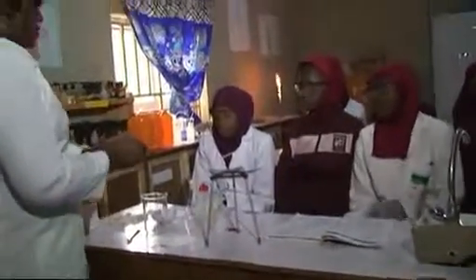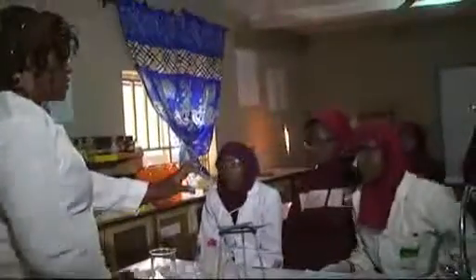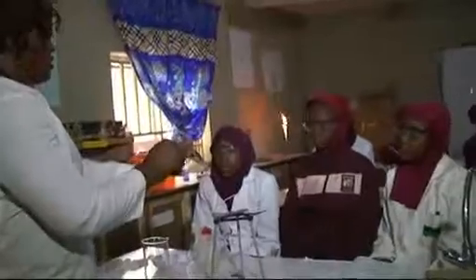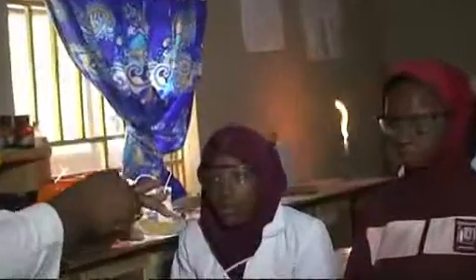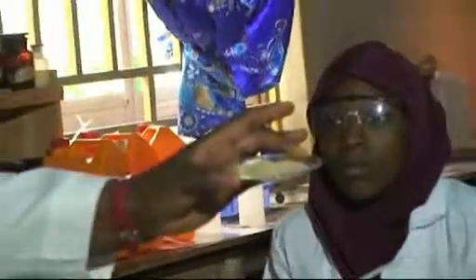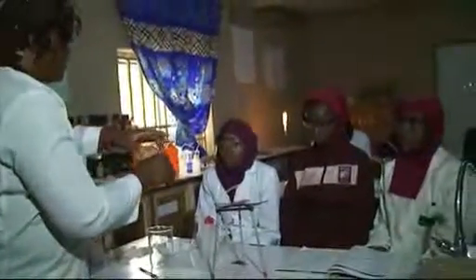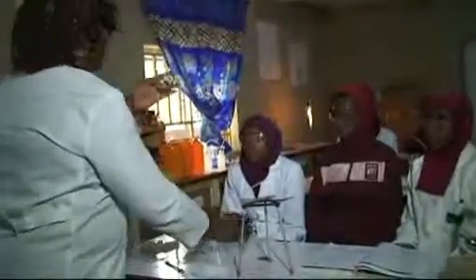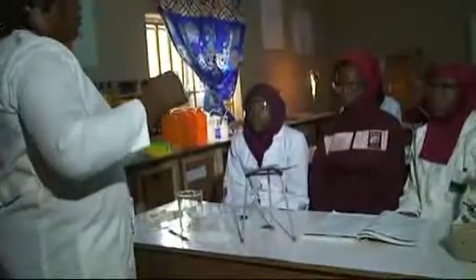We have before us the sand and the salt in your watch glass. You see the sand and then you have the salt. Now when the sand and the salt mixes up, there is no way you can hand pick it. Rather, you have to use this separation technique to actually get it done. The first procedure here says when you have poured in your sand or your mixture, add about 10 centimeter cube of water.